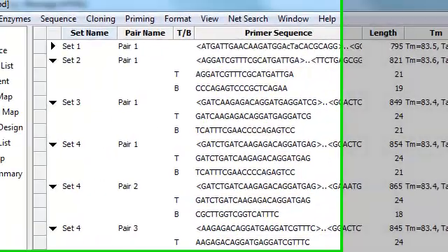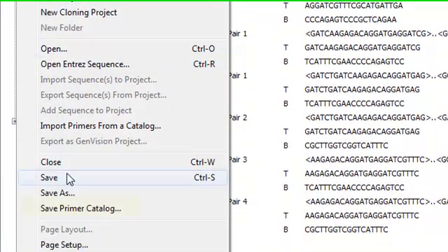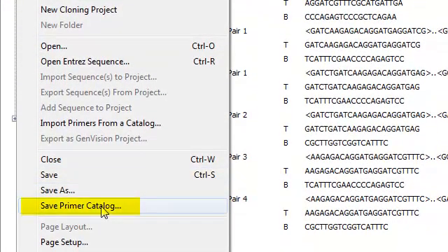So if I wanted to export this list of primers, I would go to File, Save Primer Catalog.